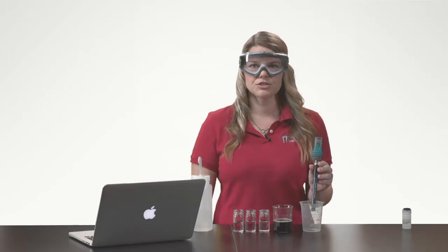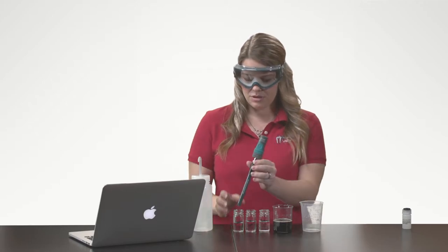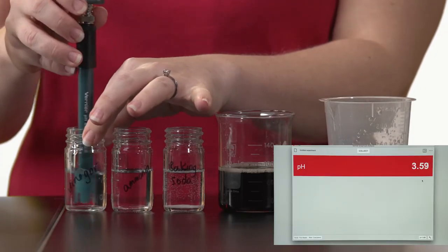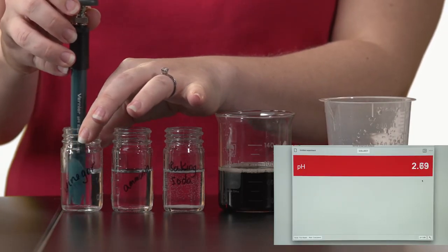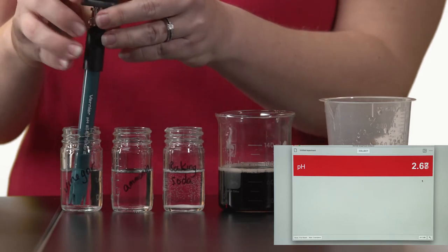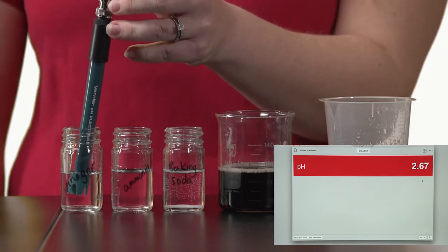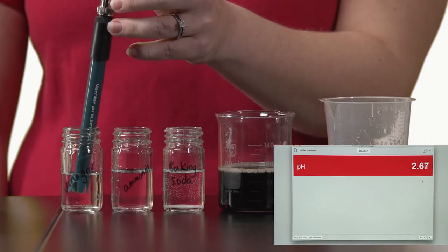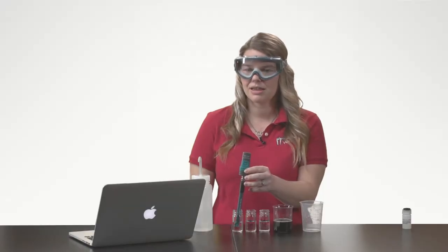The first solution I want to measure is going to be vinegar. I place the pH electrode in the vinegar and provide a little bit of stirring and monitor the pH reading. Once it's stable, then I'll record this pH value in my laboratory notebook.